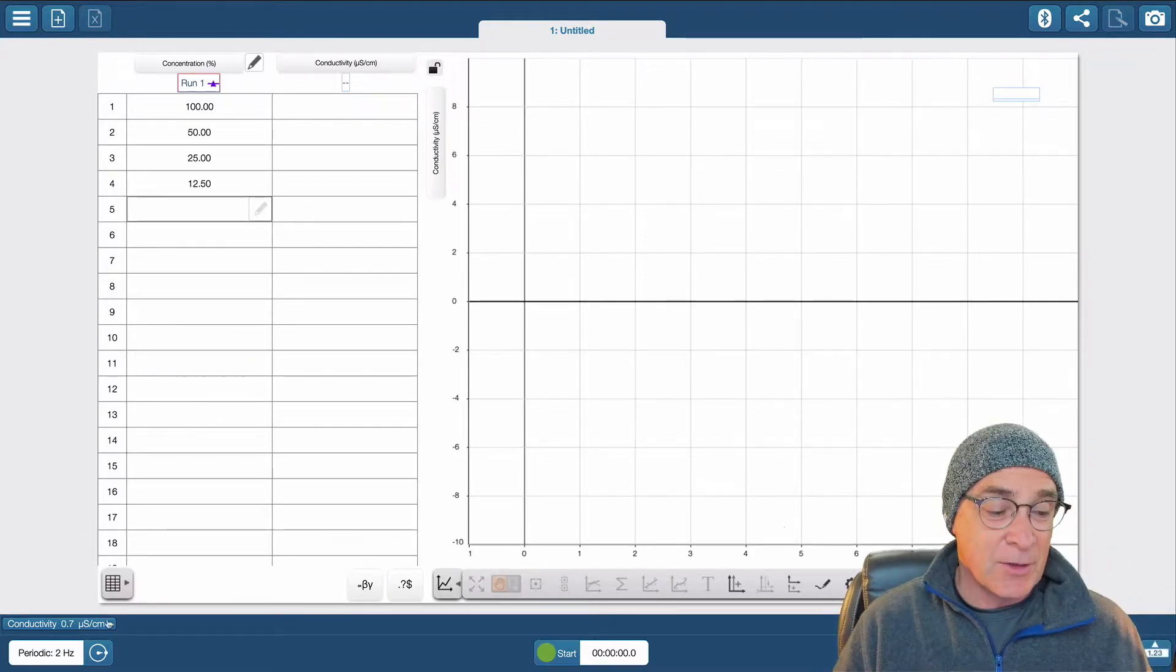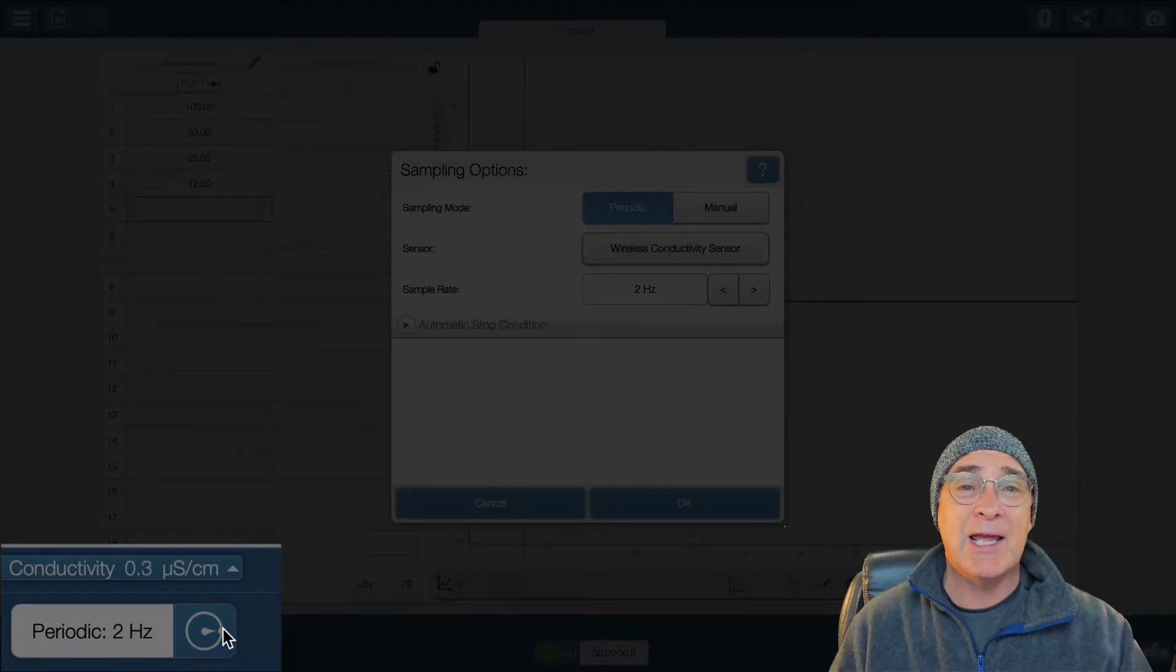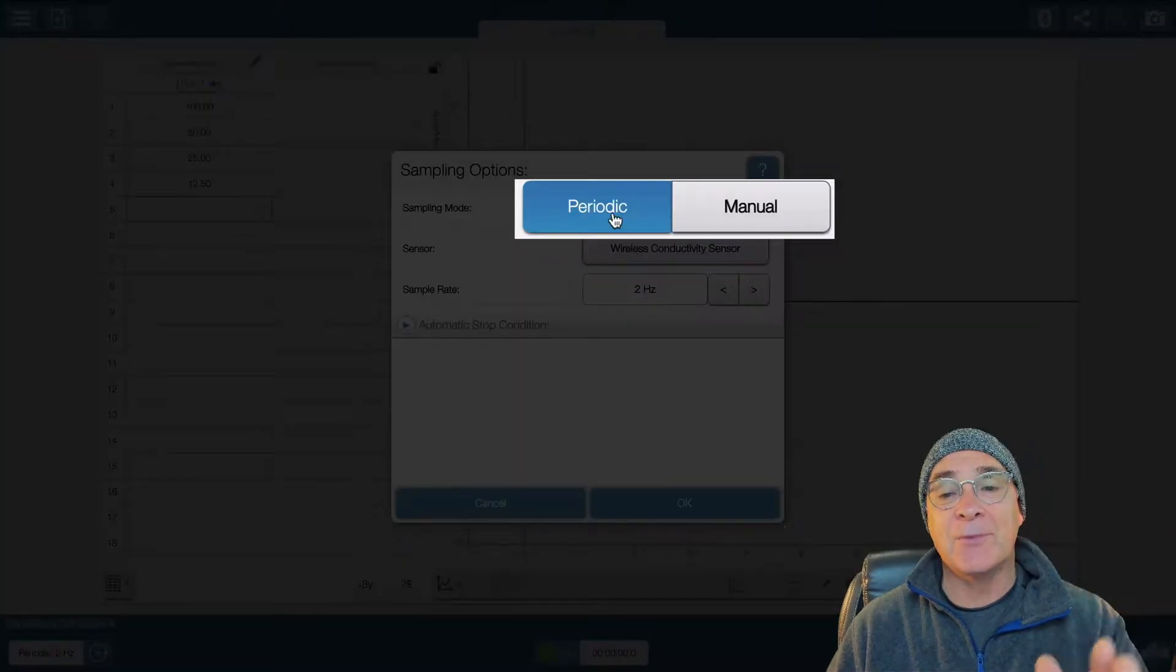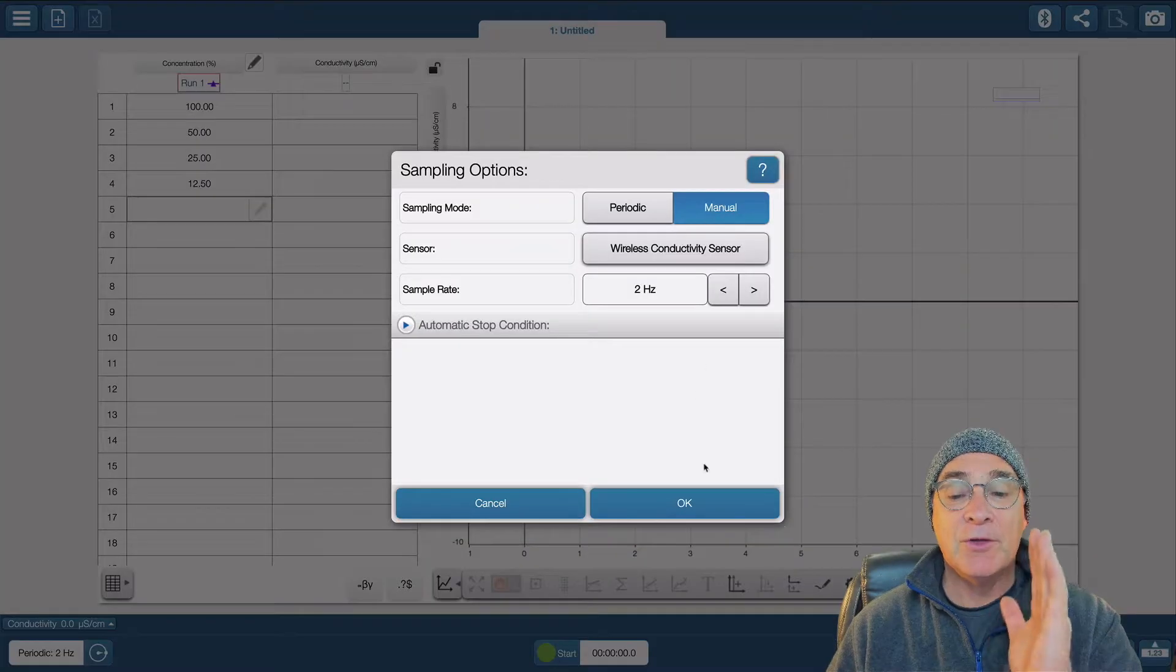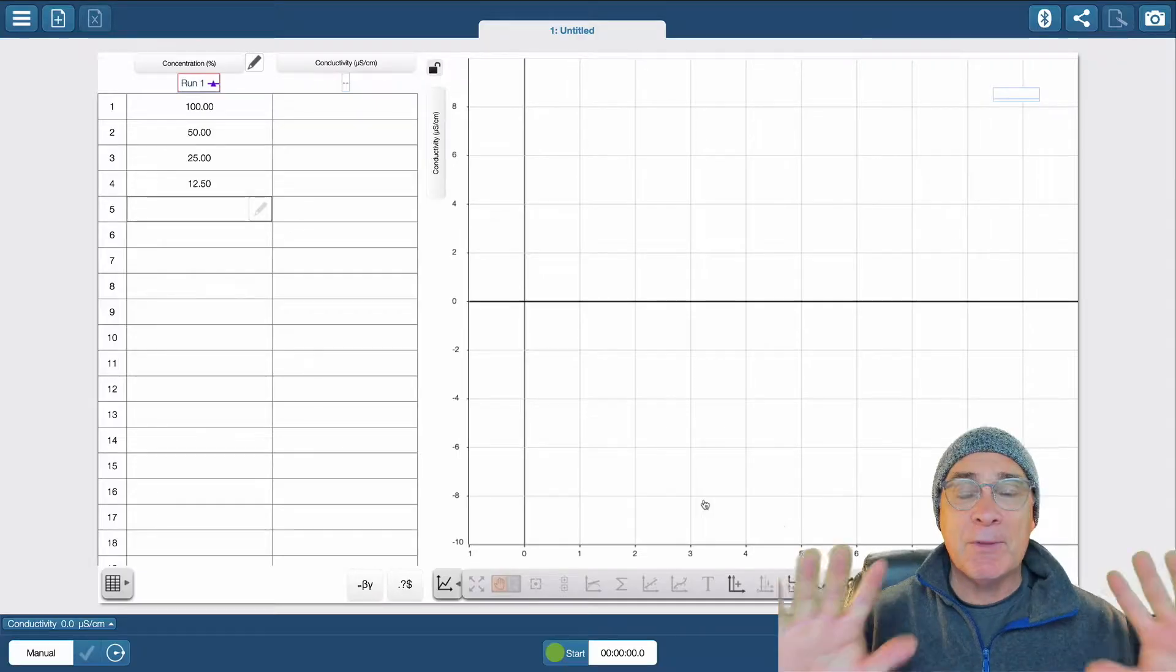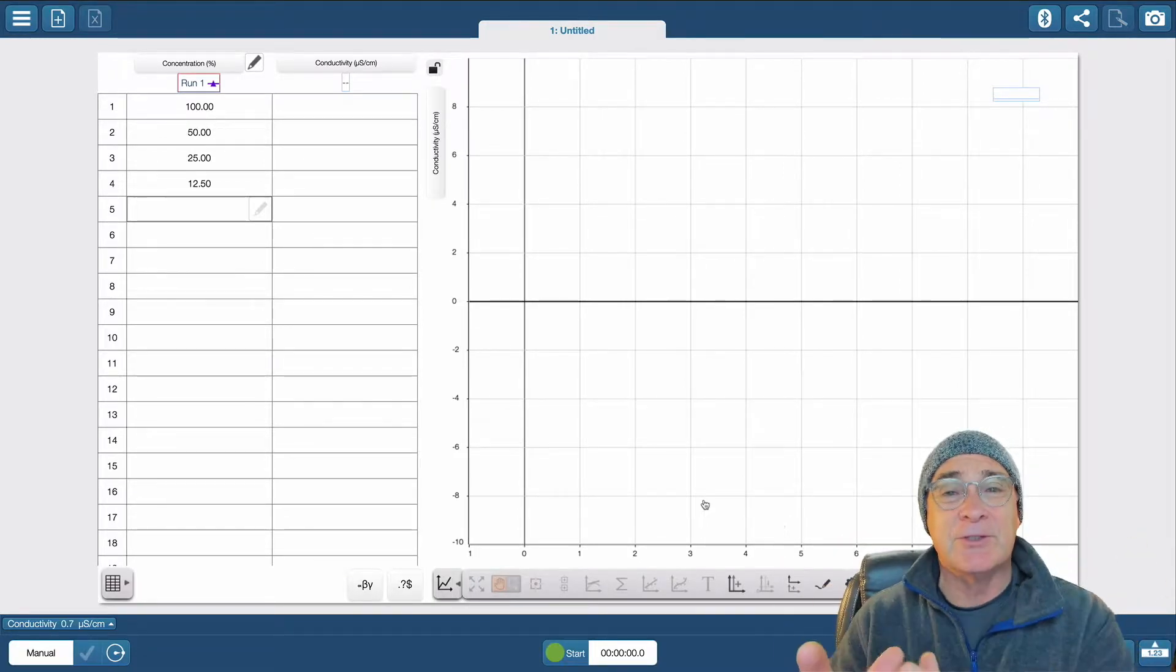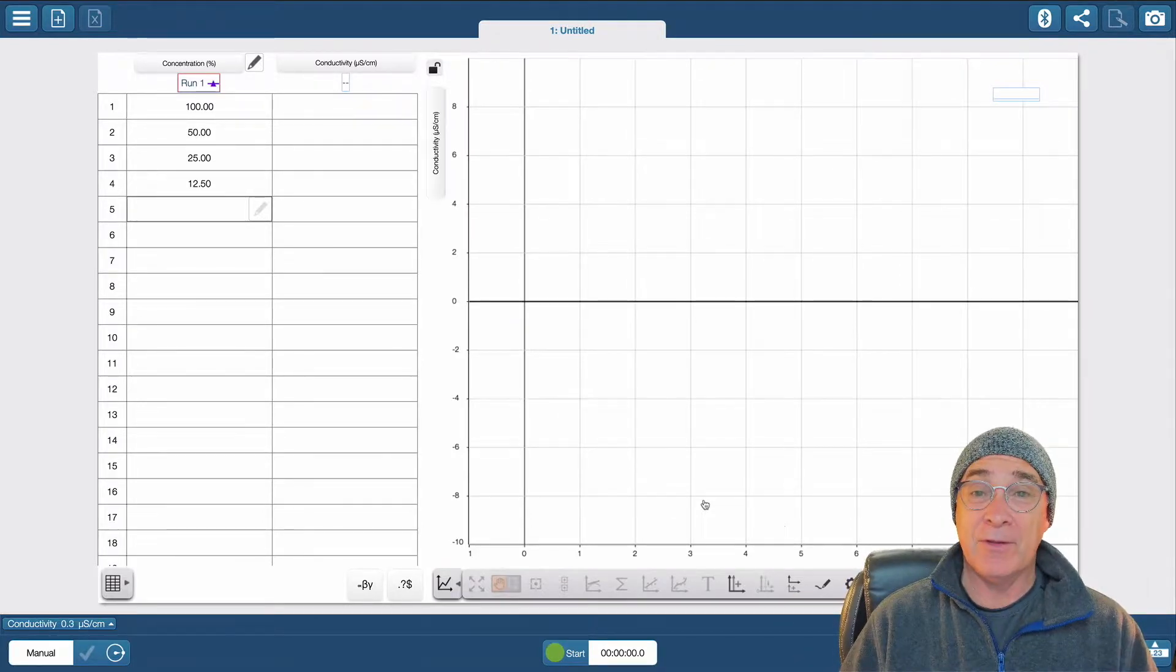So then what I'm going to do is press on this lower left-hand corner where it says periodic. At this point it will give us an option between periodic and manual. You're going to click on manual. And when you do that you press OK. Now we're pretty much set up. The next part of this video is we're going to be looking at the serial dilutions. And then lastly we're going to also be looking at the analysis.